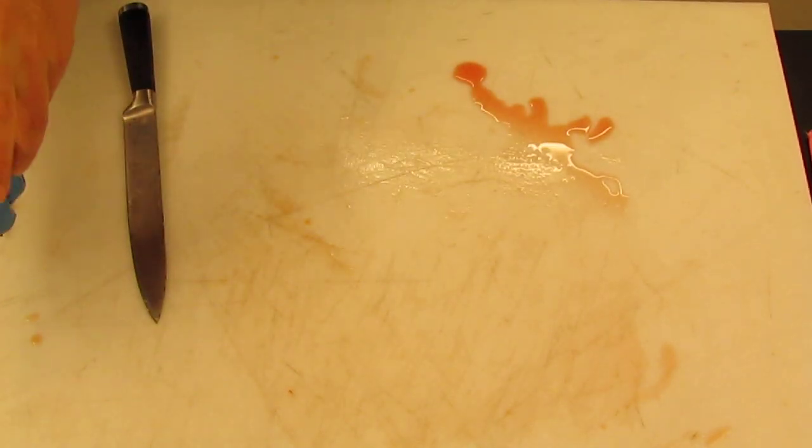But while I'm here, this deep into it, what I have done is pulled some of the muscle tissue away from the bone. So here is the bone. And deep down, nestled in between all of these muscles, I have more blood vessels. Okay, so these are blood vessels here. And this really thick white structure right here is a nerve. Note how the blood vessels and the nerves are always going to be together. Okay, so if you find a blood vessel, you should also be able to see a nerve.